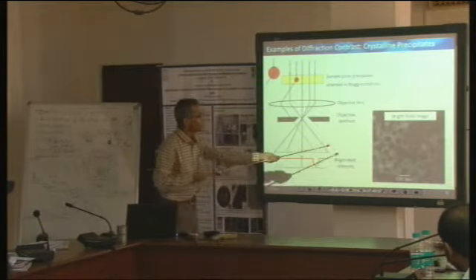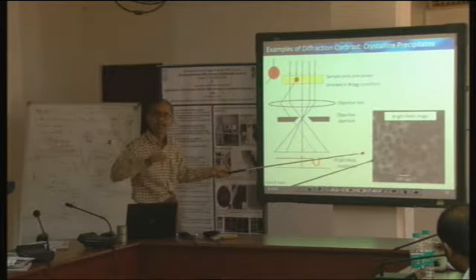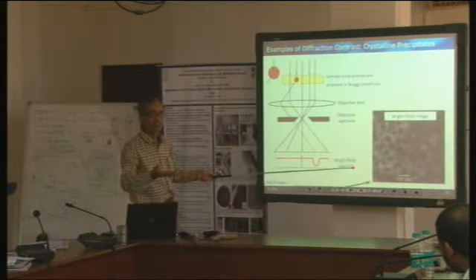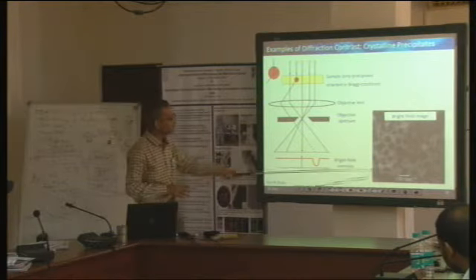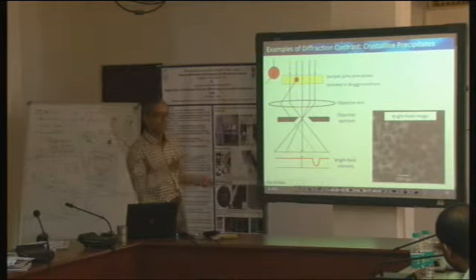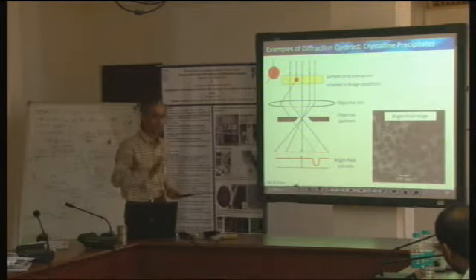In that case, this is a bright field image, and since only the precipitates satisfy the Bragg diffraction condition, intensity is scattered away from the 0th beam. If you now make an image with the 0th beam, only the precipitates, which are scattering away the intensity, will look dark. They all look dark, for example. But this holds good only if that metallurgist is able to synthesize the material wherein all the precipitates are oriented in the same way. That is a must. This may not always be possible.